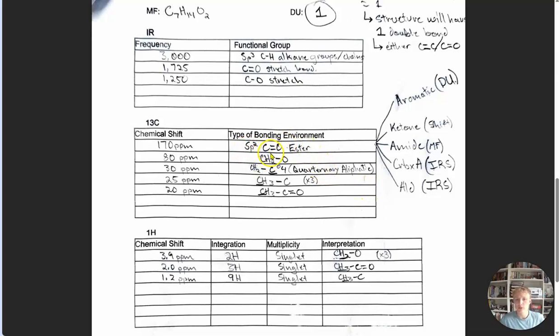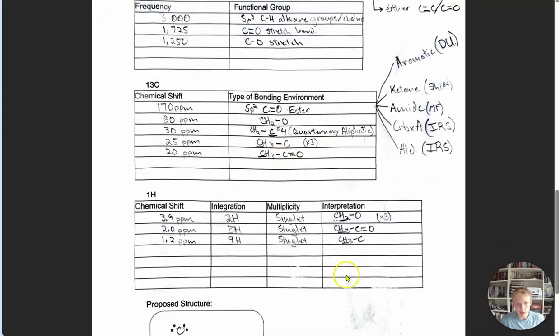And so this is an sp2 carbon double bonded to O. And because we also have this C-O sigma bond, we know that we're thinking that we have an ester now. We wouldn't be able to say this was an ester without this additional C-O bond, but it really fits our chemical signature right now.